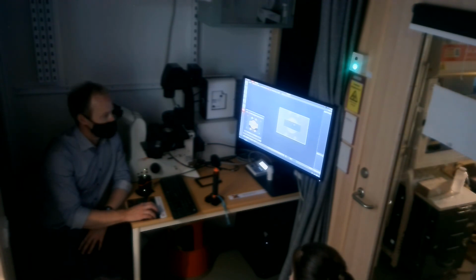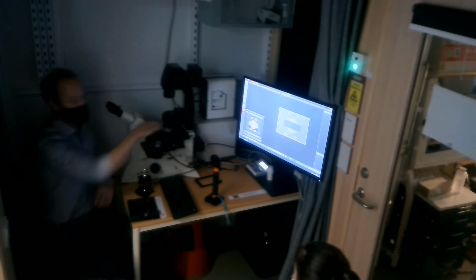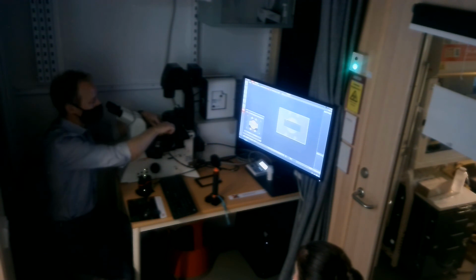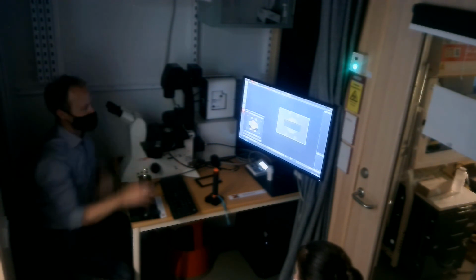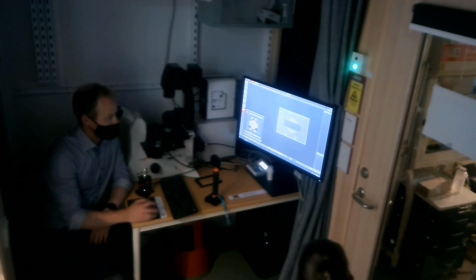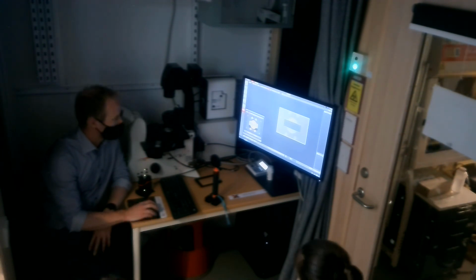By default, it will always place this in the middle, but perhaps especially with this frame that I have, I could physically move my slide over here or over here. So I would have to align it, and there is an alignment procedure that you can use. I will not do that with the slide because, again, the slide is maybe less important.